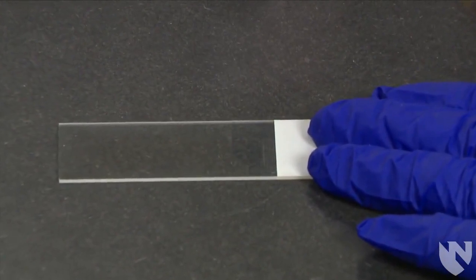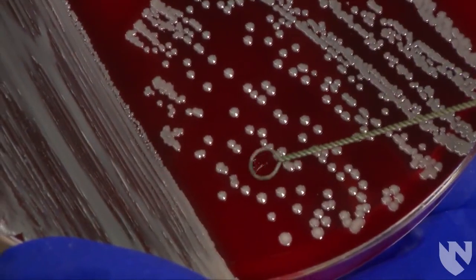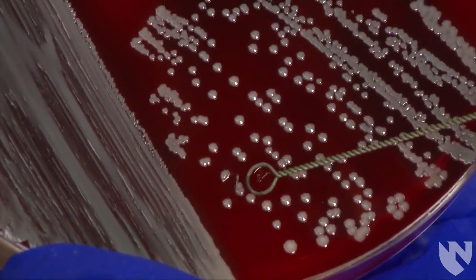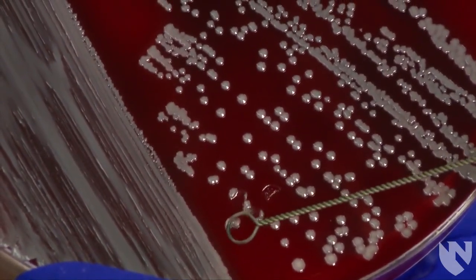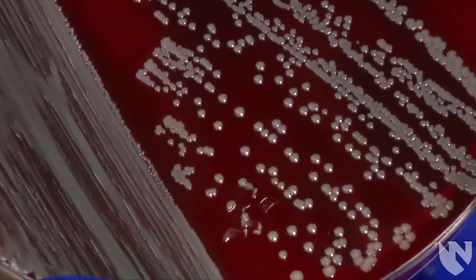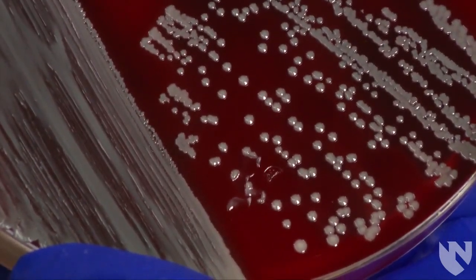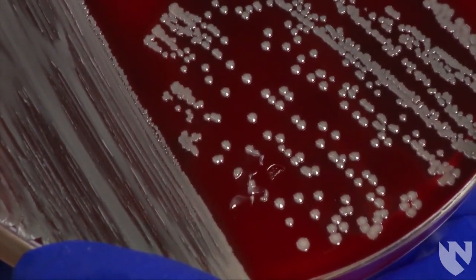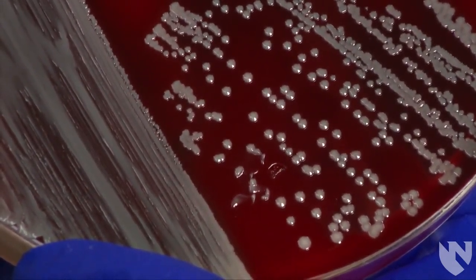Place a clean microscope slide in front of you. Gently touch the top of 3 to 5 well-isolated colonies growing on a non-selective media with a sterile wooden stick or loop. You want to make sure to pick up a sufficient amount of organism to see the reaction.